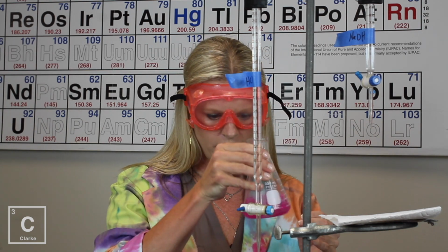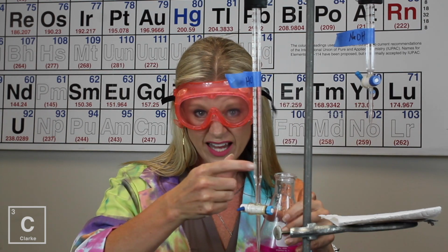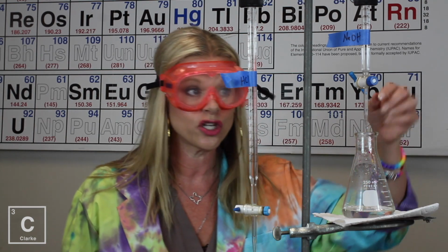Should have just kept it where it was. Anytime you go too far, you've got to add a little bit of acid to take it back. Since I took it too pink, too basic, I needed to add a little more acid in. I had to pay attention to where the level of my acid was, pour some in. When I stopped, I took the difference. I only added in 0.3 milliliters, but you see it took me back to clear.